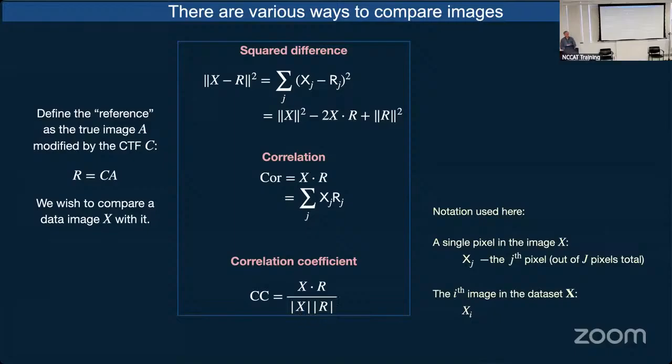What if we have a de novo structure without a reference? How do we do this? Well, we have to somehow have a structure to start with. In the old days, people would get a de novo structure by forcing the angles to be known values.